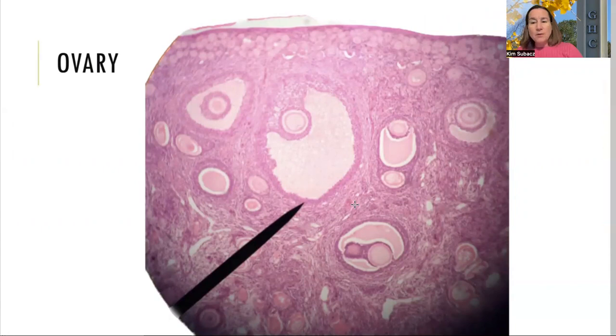When you hit puberty, those eggs will start to develop. So we've got all different types of eggs in here, different types of follicles. You're going to have your primary eggs, and that's this stuff all up here. On the edge of the ovary, I think it looks like bubbles, but you may think it looks like something else. I think it looks like little bubbles, and all the little bubbles are baby eggs.